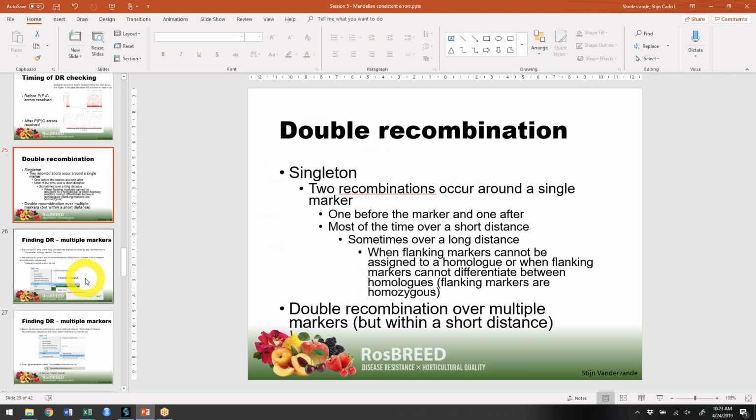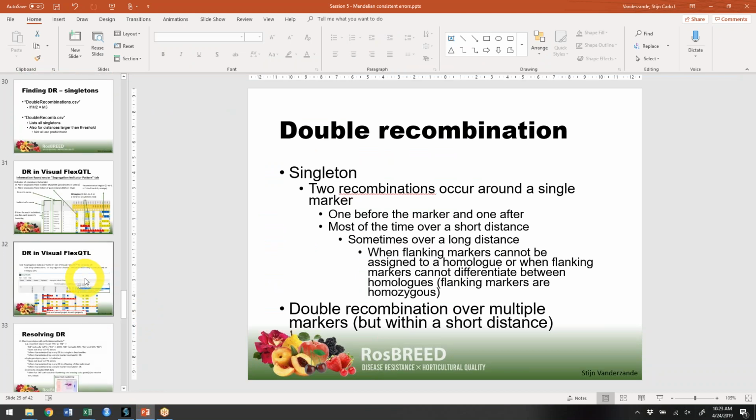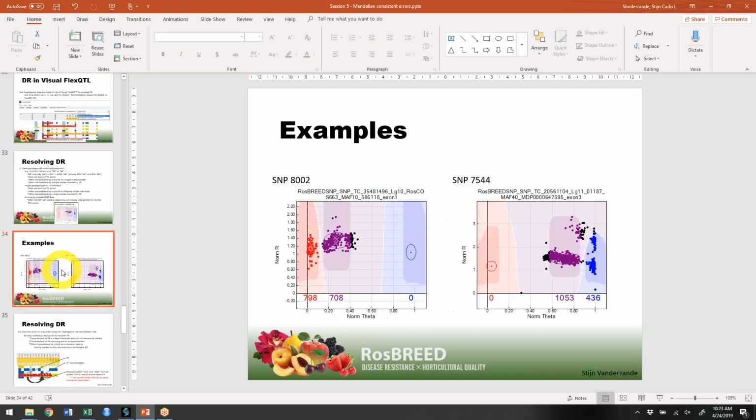You don't have the Genome Studio project, so I'll just show you what it looks like. This is what marker 8002 looks like. And so I hope you by now are a bit familiar with these plots, and you can see what's happening here, that the clusters are shifted, and that at least the BB cluster is probably not called correctly.